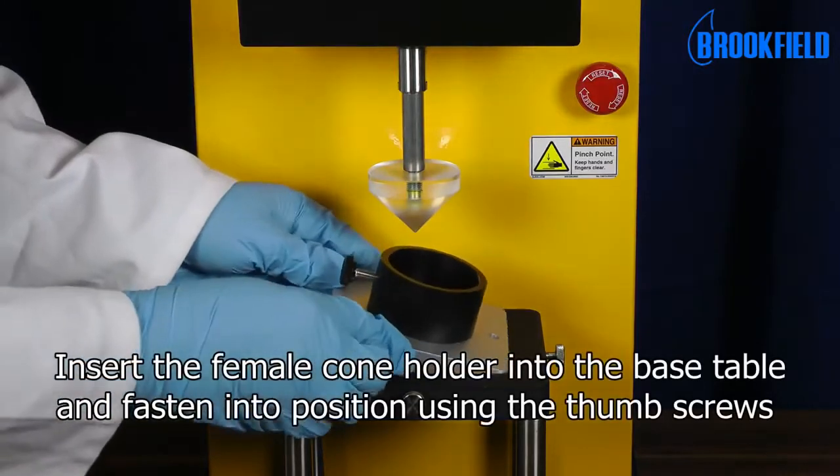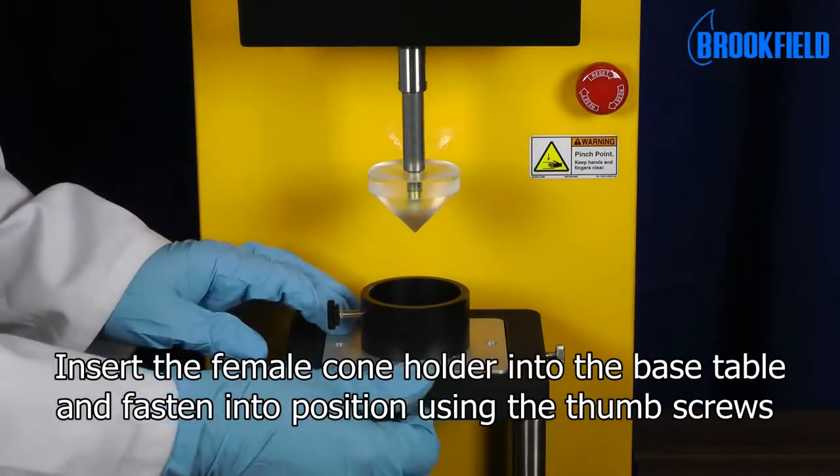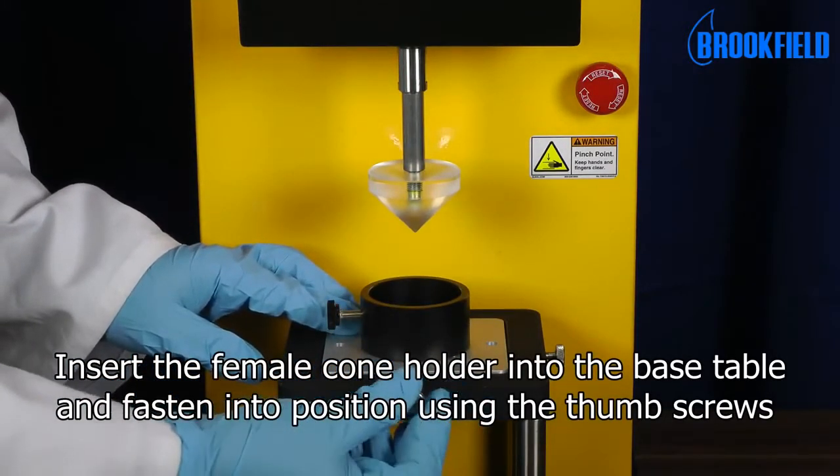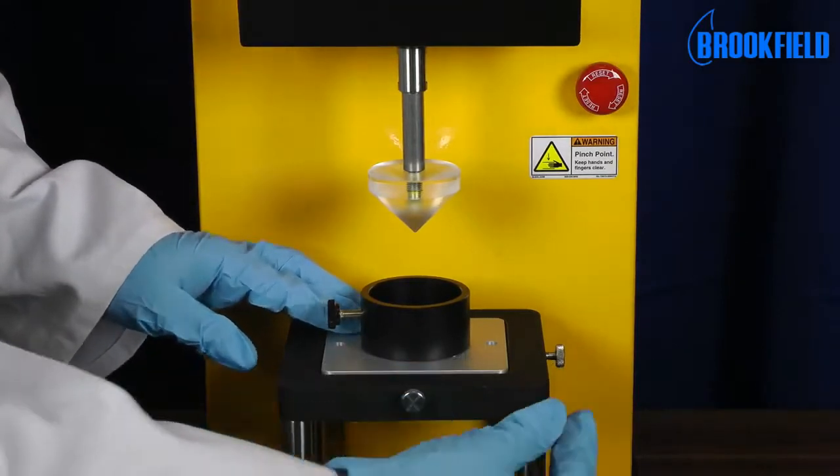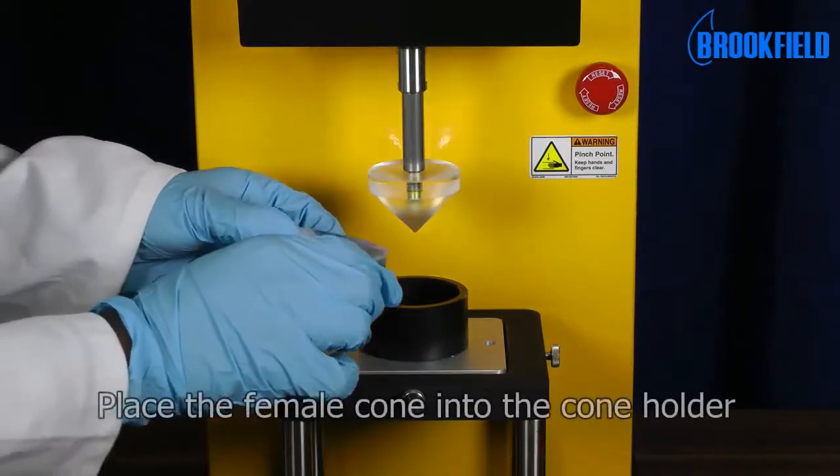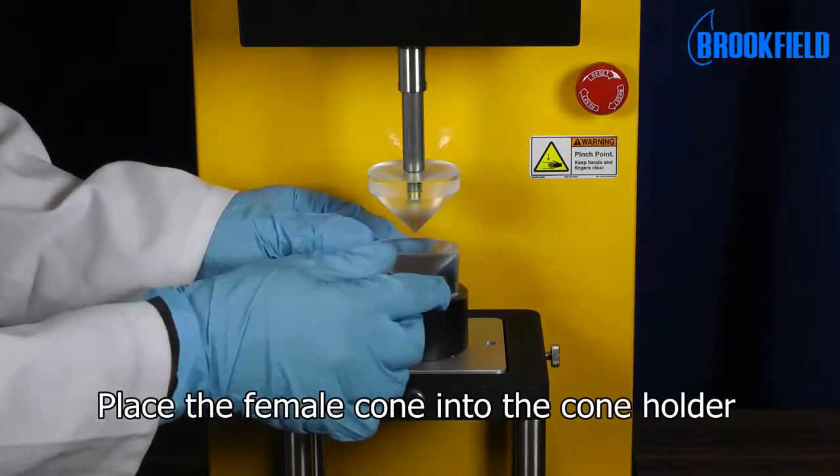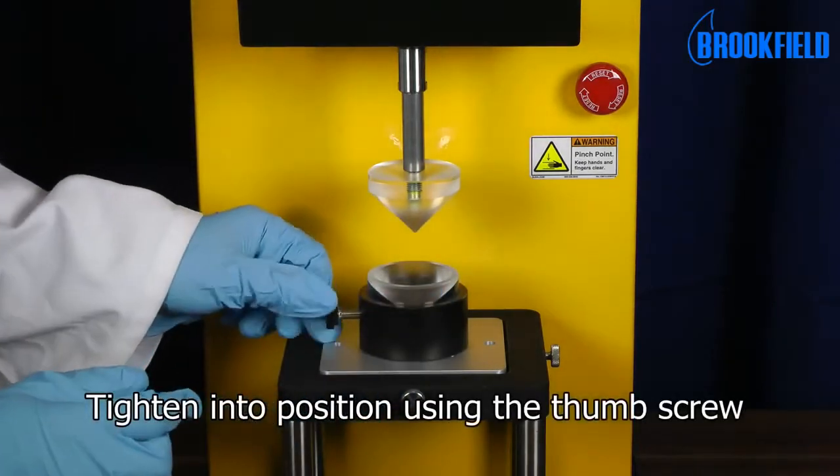Insert the female cone holder into the base table and fasten into position using the thumbscrews. Place the female cone into the cone holder and tighten into position using the thumbscrew.